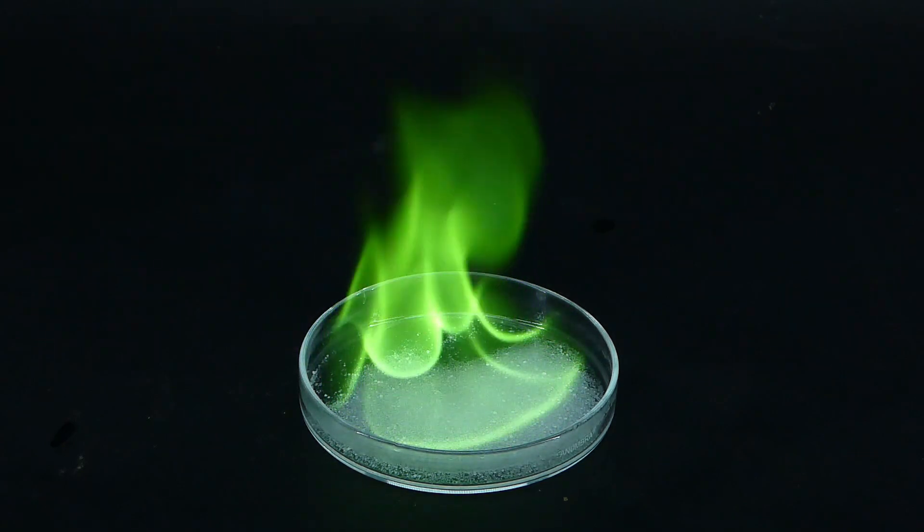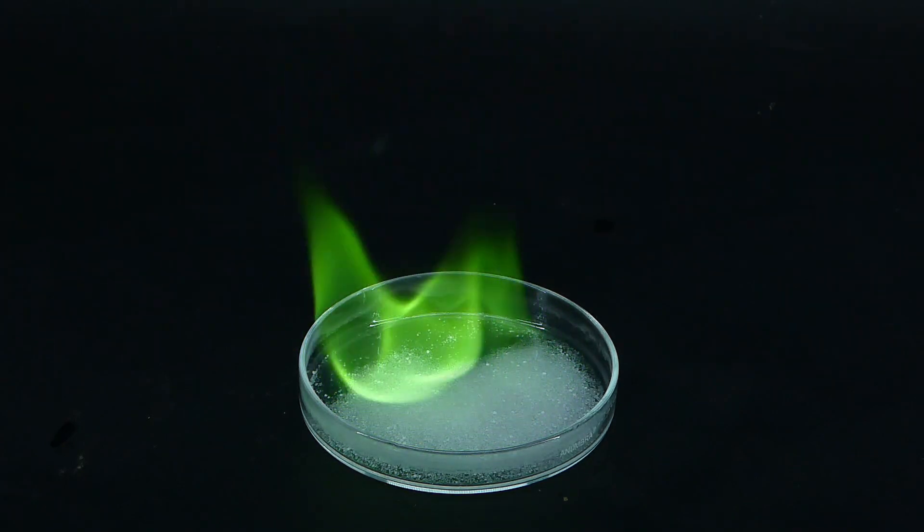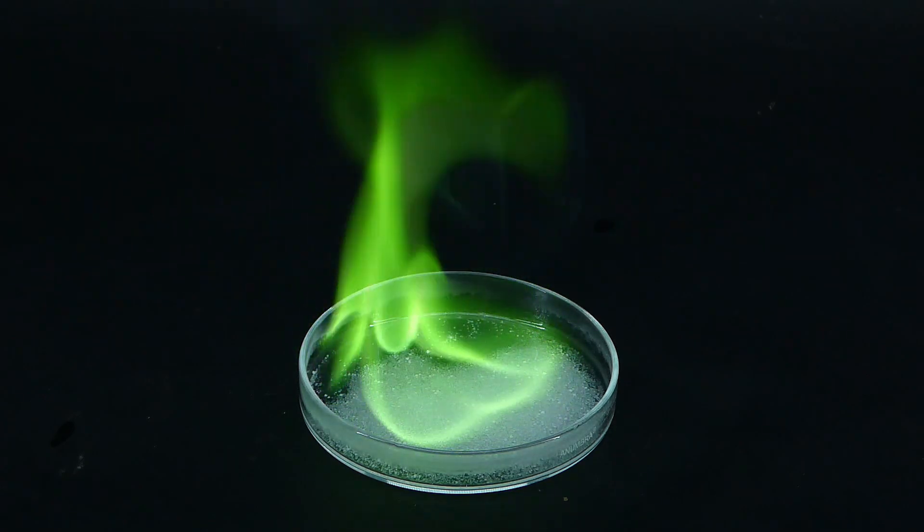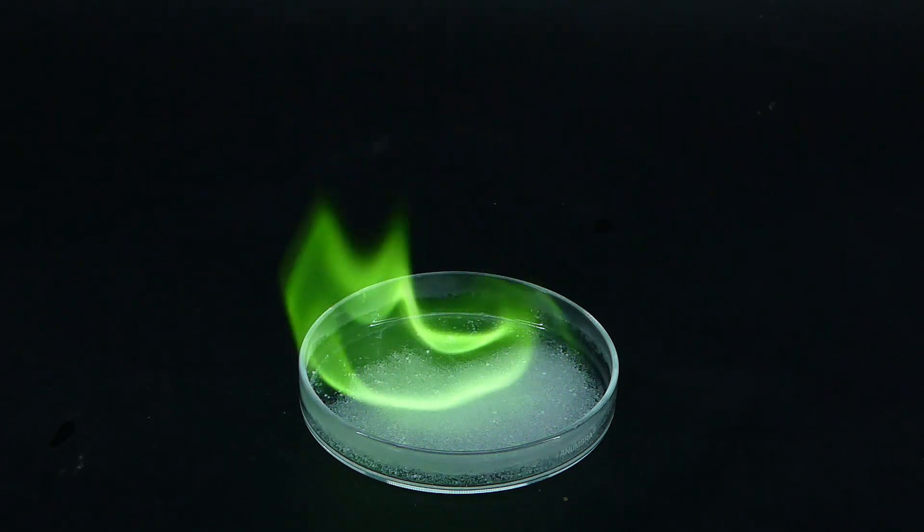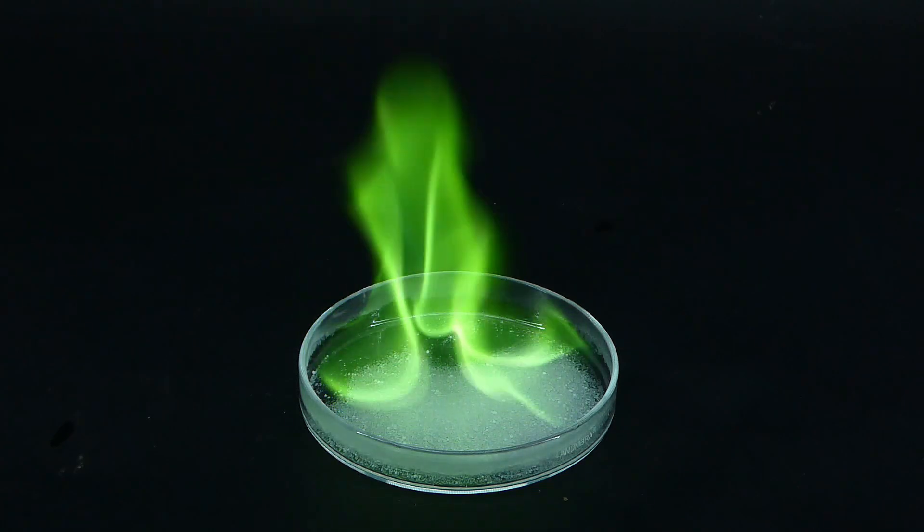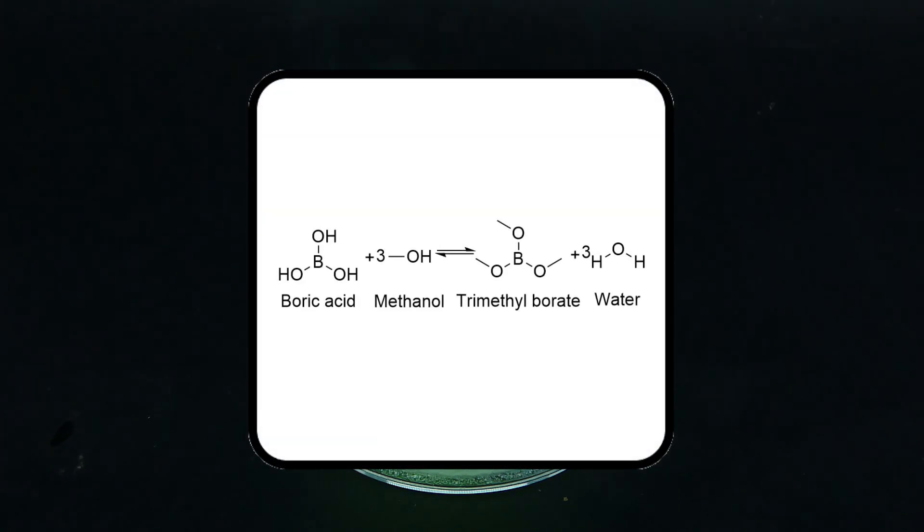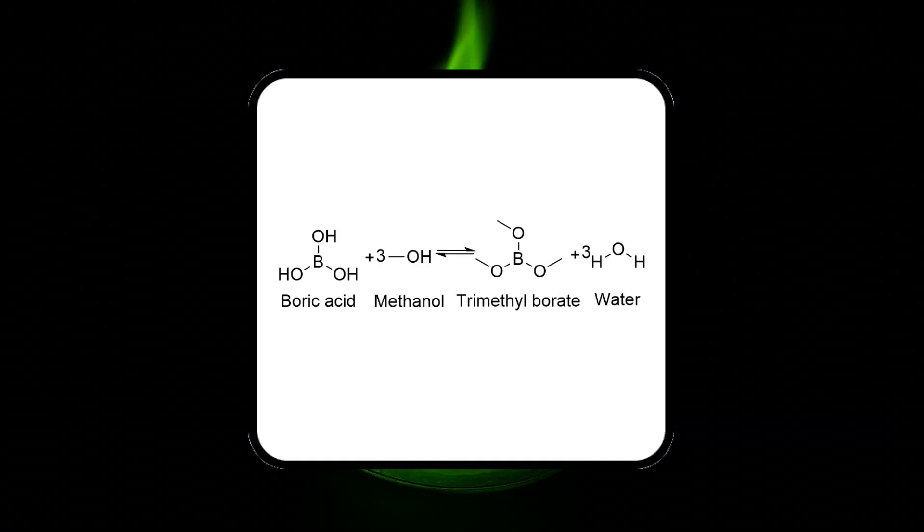The boric acid methanol one is much better because its flame is clearer. It works like that because there is a chemical reaction going on between the boric acid and methanol, producing a chemical with a beautiful green flame. However, this reaction is very slow and happens based on equilibrium, so the effect is not the best.